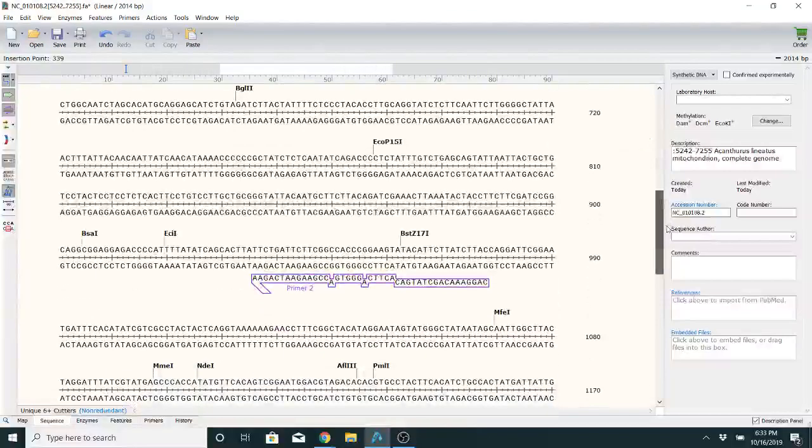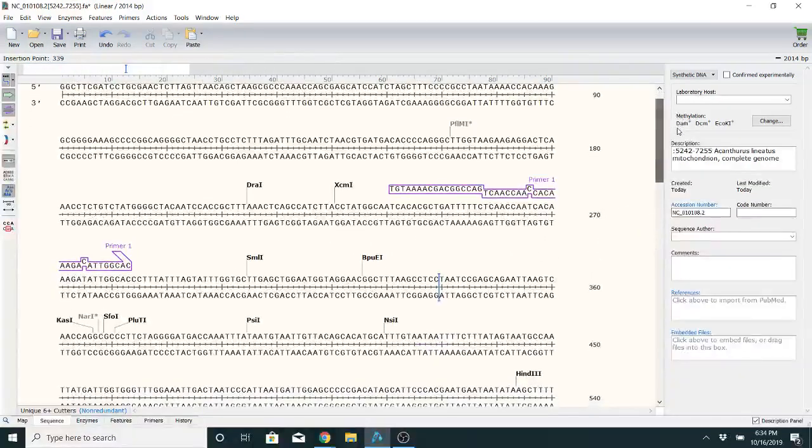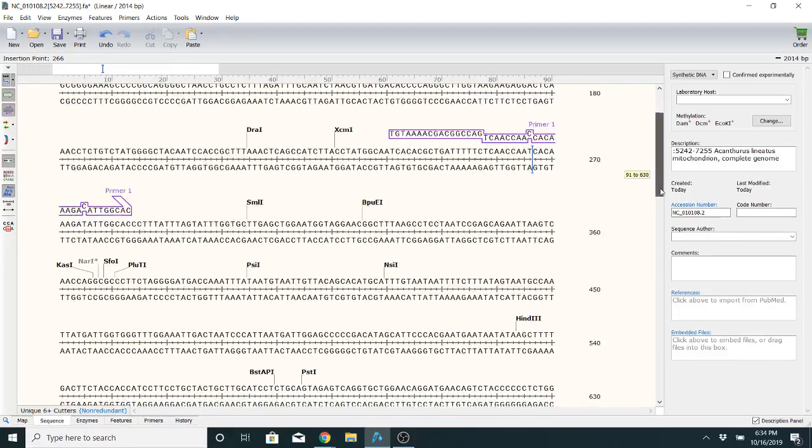And you can see that the primer doesn't perfectly bind. Now these have an M13 tail on the 5' end. And that's just a sequencing site, so that the product will have those sequencing sites on each end. And it's the same up here. But you can see that the sequence doesn't perfectly match between the primer and the template. And in the cases of genotyping, that can happen.